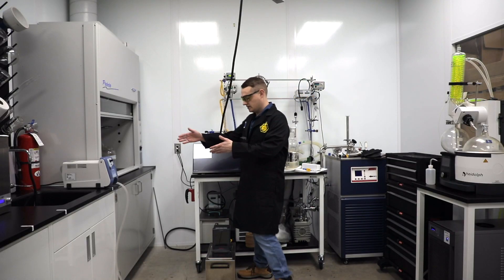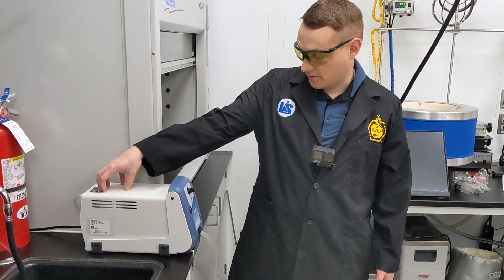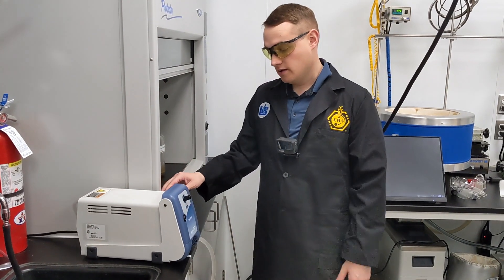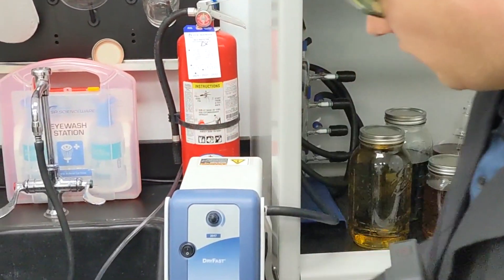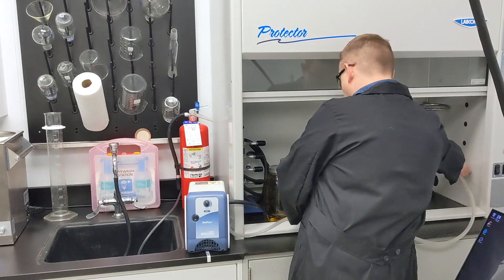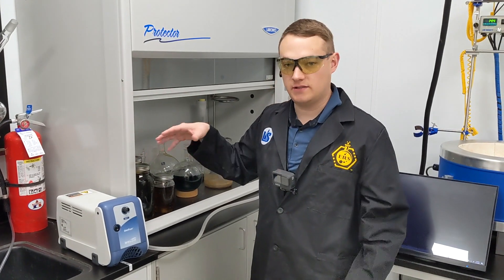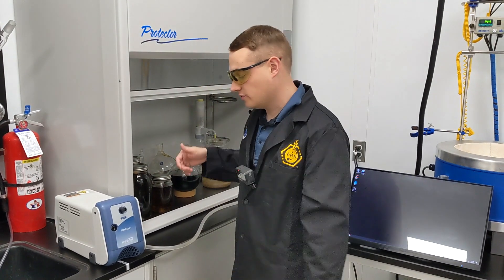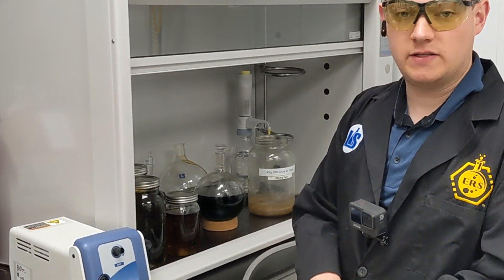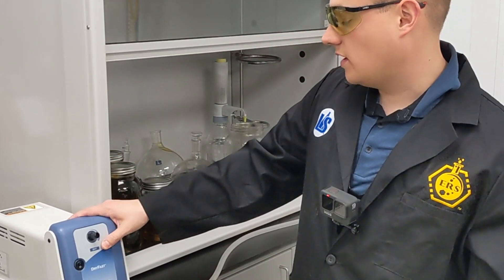The first pump we're going to talk about is this one on the bench. This is a Welch Dryfast 2047 pump — a diaphragm pump with two diaphragms. Essentially, this one is a pump in a box. We've got the inlet on the side and the outlet on the back. This tube is always going to be inside our hood so that anything that comes through the pump that stays a vapor will get exhausted out of the laboratory. This pump is going to be best for filtration, and maybe very minimal amounts of distillation in the low vacuum range.